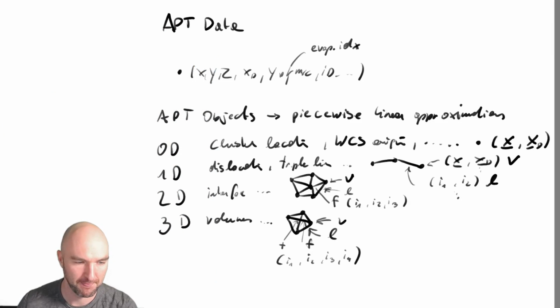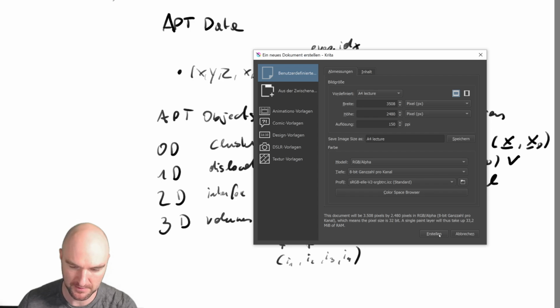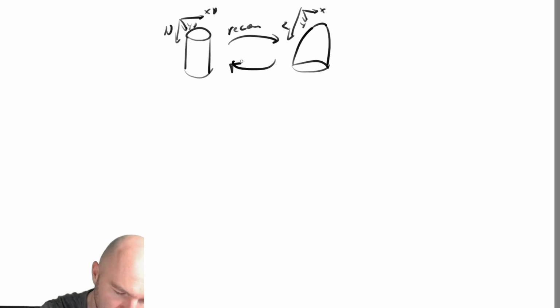So what we're actually doing, and you're going to see that a couple more times tomorrow, is something called the barycentric transformation. So we need to have some way to get from our detector stack, which has X detector, Y detector, and N, to move between this one and our atom probe reconstruction, which has X, Y, and Z in natural coordinates. And this is our atom probe reconstruction, but we also need to have an inverse of the reconstruction, so our recon to the power of -1.